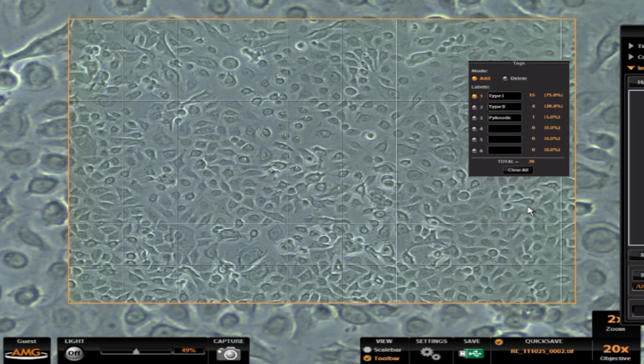I can look at it later and decode exactly what the categories were and what was counted and track it very nicely. And that's basically the cell counting tool.